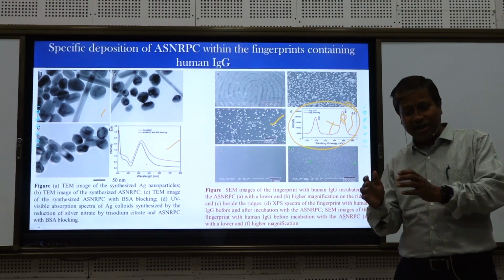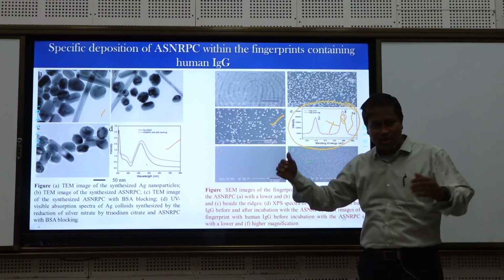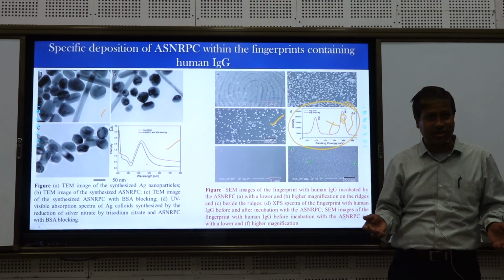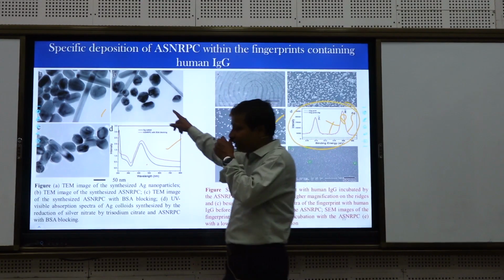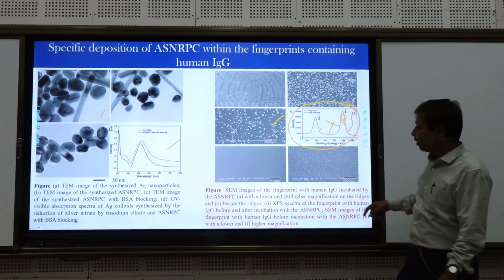If you want to highlight the subject, then you have to take care of whatever all possible instrumentation is there, which will give you more and more information through which we can understand the system. Understanding the system is more important. That is why this kind of image is there. Again spectroscopy, again image. So everything is there.